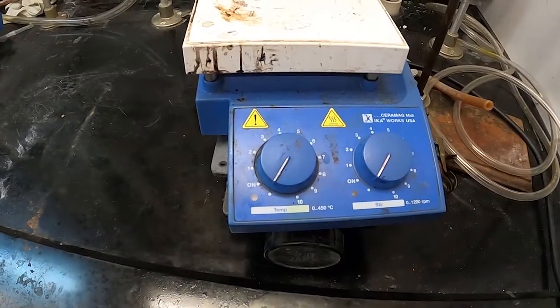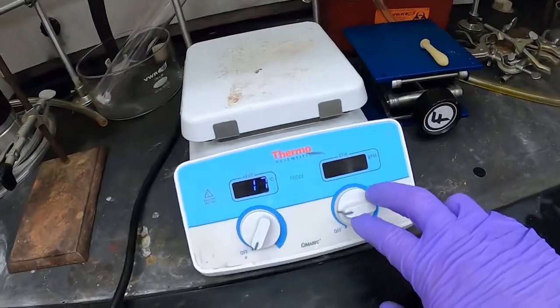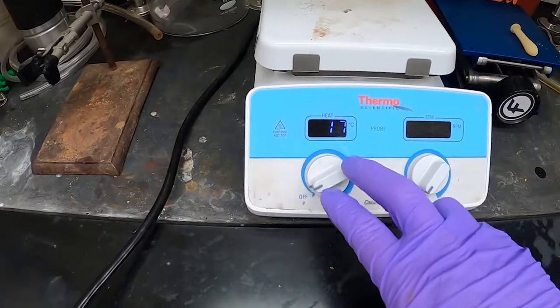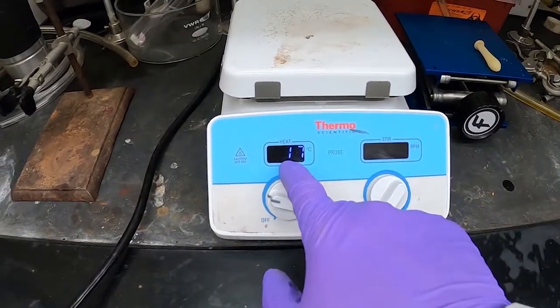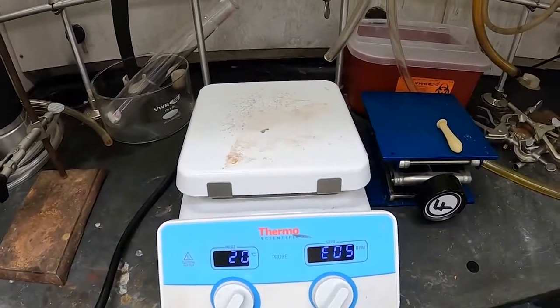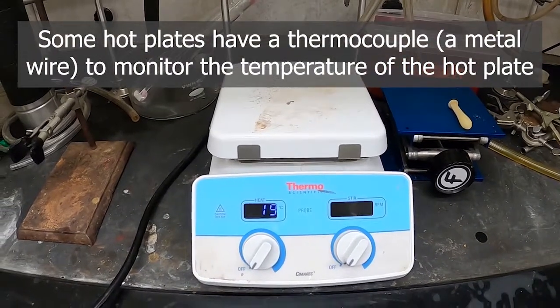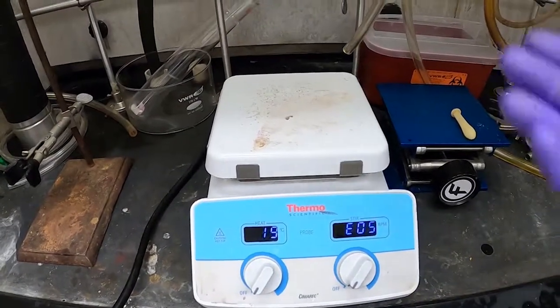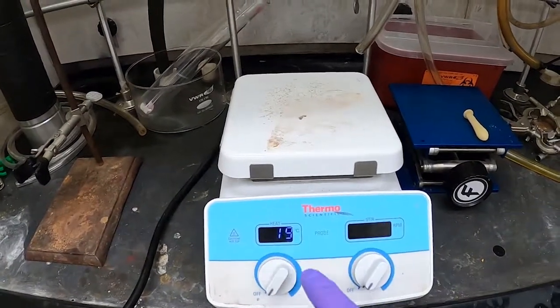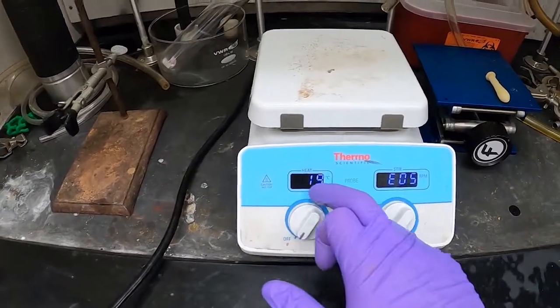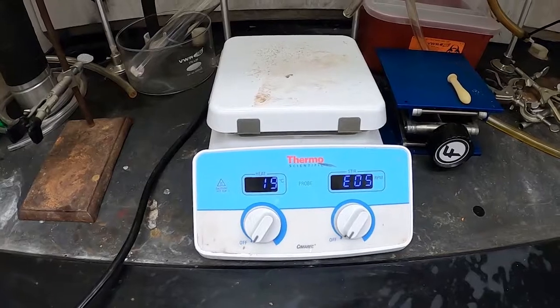You'll just have to kind of guess to know what the actual temperature of that is. Of course you use a thermometer or thermocouple. Another kind that's in the lab is this kind which has digital dials. This one reading air for the stirring portion of the temperature, it actually gives you a number. However, for most stir plates like this, this number doesn't necessarily correspond to the actual temperature of the hot plate unless you have a thermocouple attached. So you will need to have a thermocouple attached to be able to use this function for these kind of digital readout temperatures properly. With the thermostat, you can get kind of some that the thermocouple will give information back to this and so you can set a specific temperature and it will regulate at that temperature. However, the thermocouples are a separate attachment for the hot plates, and without them, this dial just functions much like the kind of one to ten or one to seven feature.